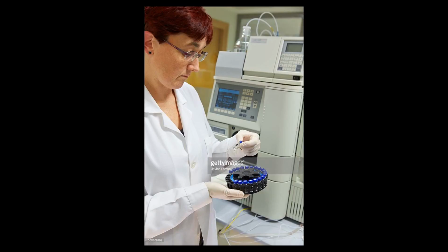Branched chain compounds elute more rapidly than their corresponding linear isomers because the overall surface area is decreased. Similarly, organic compounds with single C-C bonds elute later than those with a C=C or C≡C triple bond, as the double or triple bond is shorter than a single C-C bond.